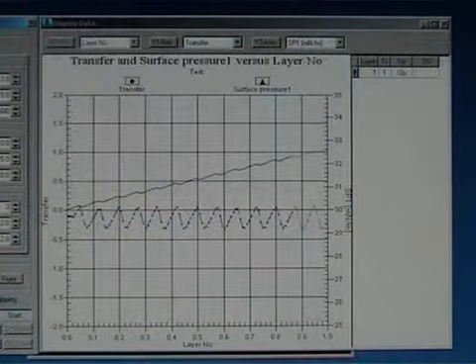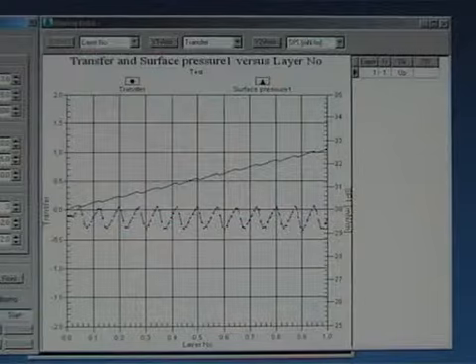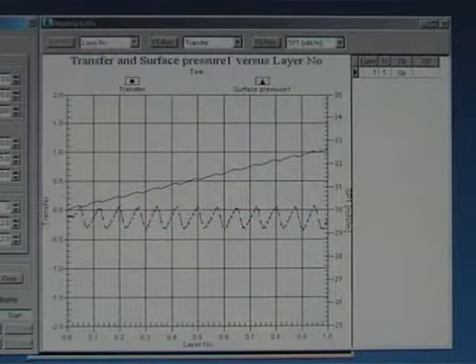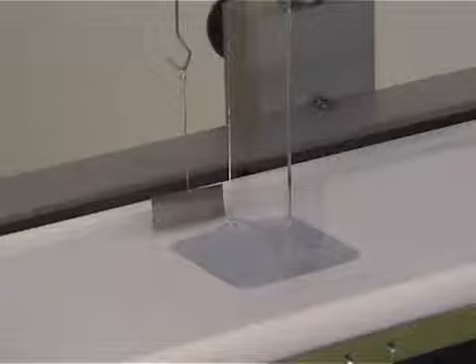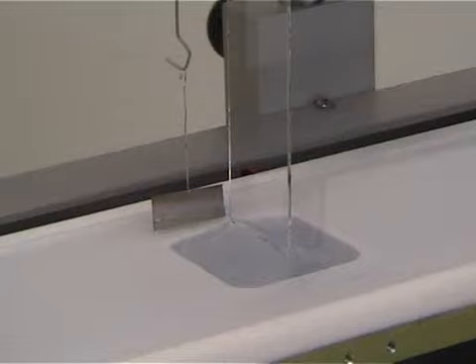If the surface pressure starts to decrease, the barrier speed might be too slow to compensate the pressure drop. If that is the case, the trough speed has to be reset from the trough control.